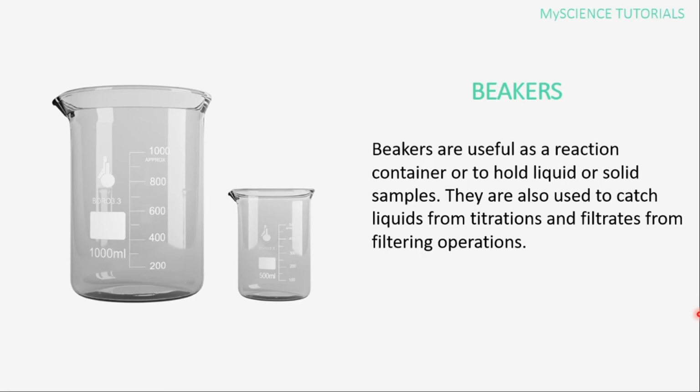We can use them as containers, just pour water or reactions or reagents in them. We can carry out reactions in them. Maybe we add an acid, we add a base to it to see what will happen. That is for bigger volumes of reactions, and they can also be used to catch liquids from titration and filtrates from filtering operations.